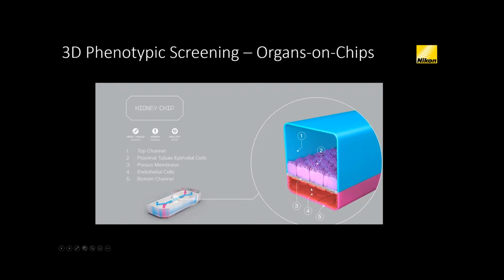It's going to get dark for a bit, and then we're going to hit the second layer of endothelial cells, and then we're going to hit the tubule epithelial cells, the proximal tubule epithelial cells in this image. So we start out at the base, we go through the luminal compartment, and we can see the cells crawling up the sides here. And then we get to the other side. Now we can image the other set of endothelial cells and now the proximal tubule cells. And we can actually make out the tubule structures in here very nicely.